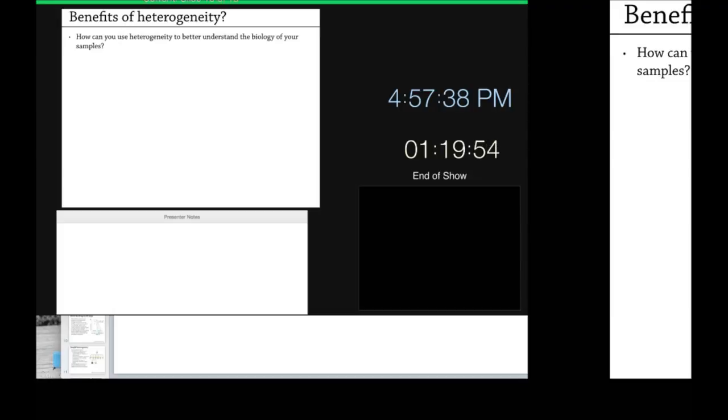Wouldn't a person need to be very cautious in interpreting the dynamic range of protein movement based on one data set or even a few data sets, because of the inherent randomness of sample preparation, which I know they're trying to attack here at the center, right? Just trying to more reproducibly make grids. Do you have any thoughts on that? Does anybody else have any from their experiences or papers they've read or just conversations with people?